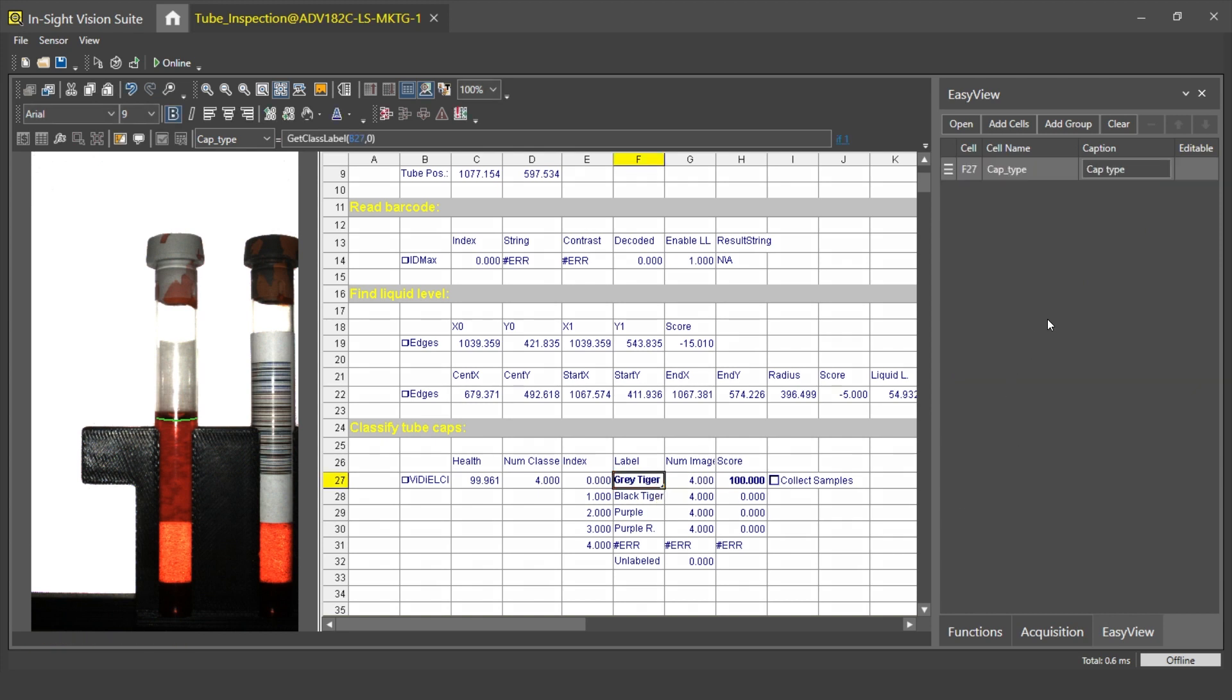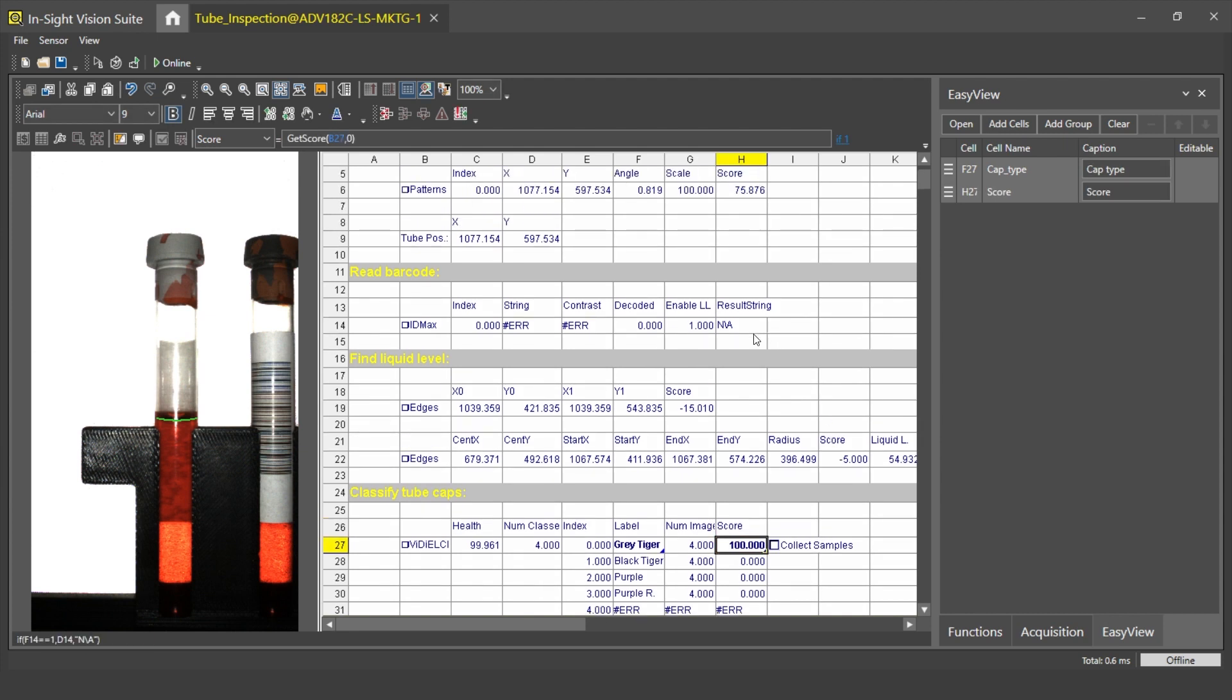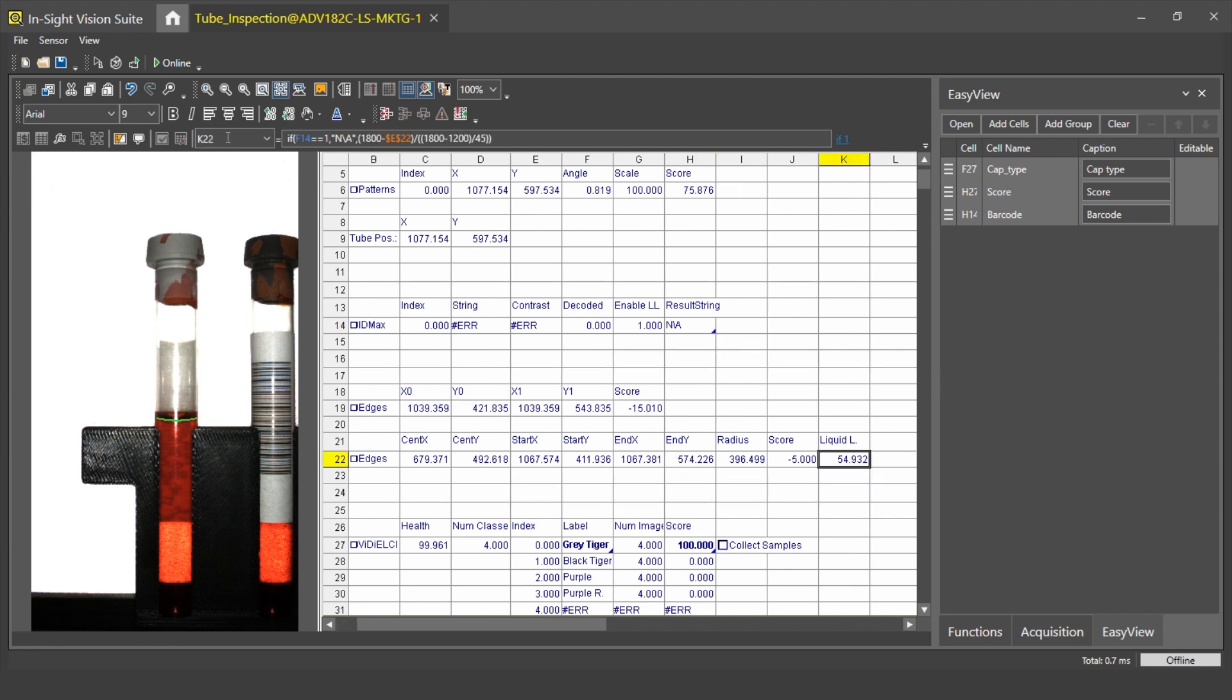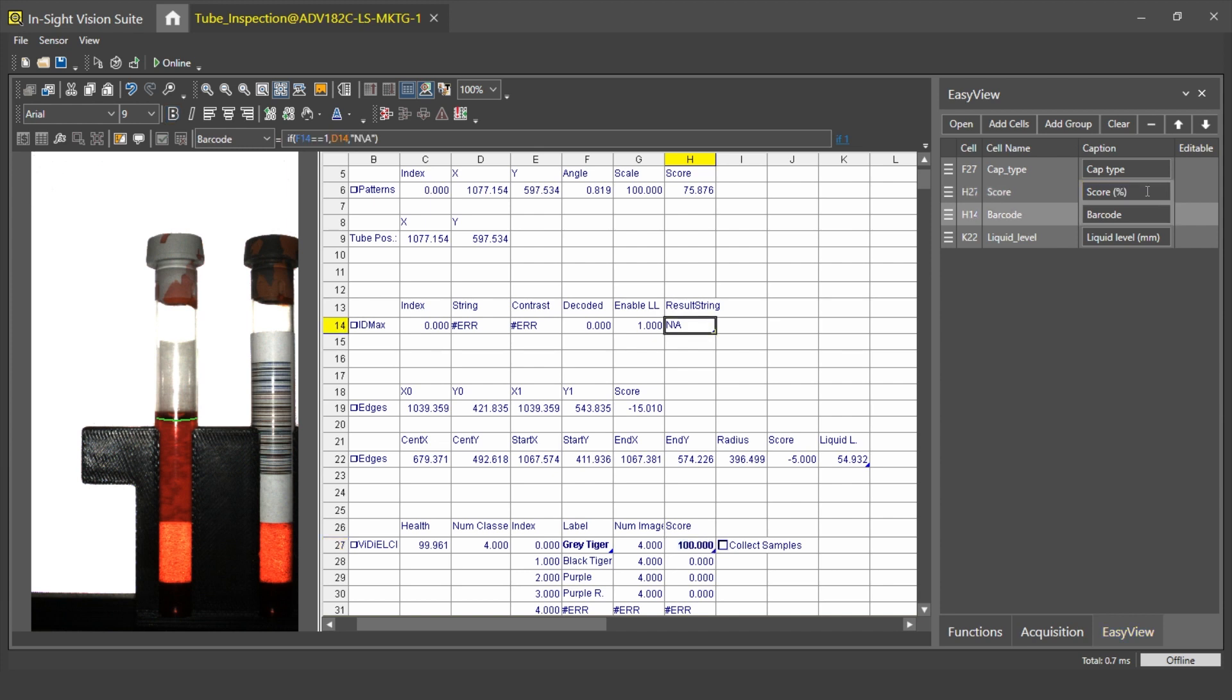Next, I will add the score. Click on the cell I want to add, add a tag to it, call it Score, add cells, select this one. The next one I will be adding is the result of the barcode reading. I call this Barcode, I go to my EasyView panel, select Add Cells, select this one. The last one I will be adding is the liquid level. I call this cell Liquid Level and add it to the EasyView panel. These fields are editable, so as the liquid level is in millimeters, I change that. And as the score will be predicted in percentage, I will add it to this field.